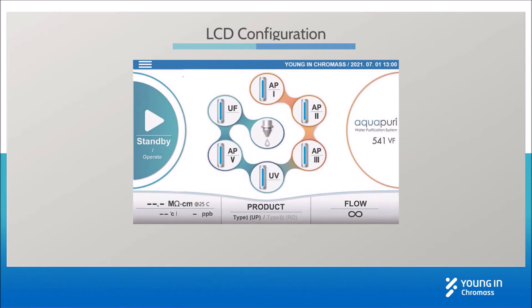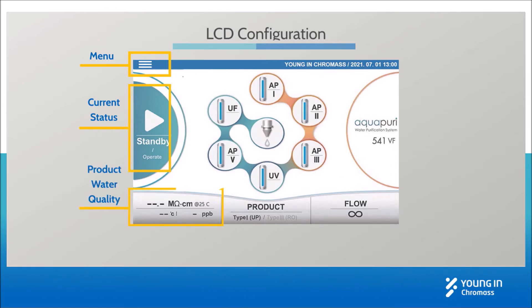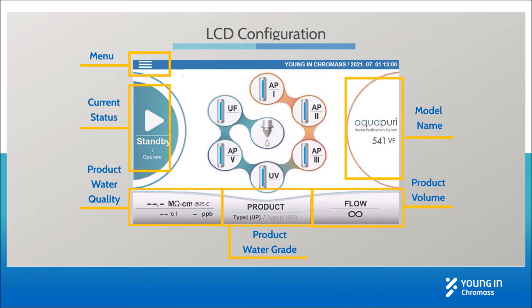After the initial flushing, the LCD will be shown like this. Let's briefly look over the LCD configuration. There is a menu, and it indicates current status, product water quality, product water grade, product volume, model name, and date and time.